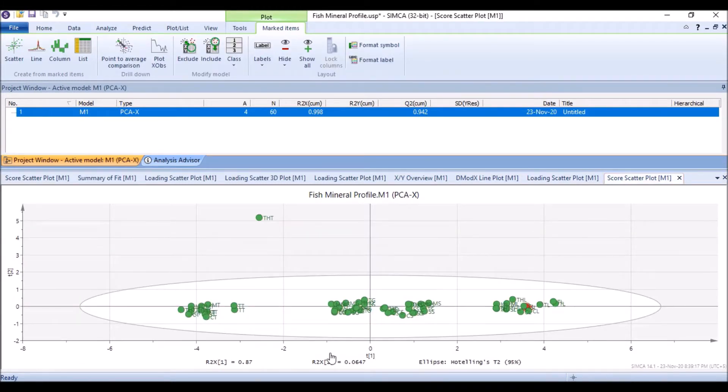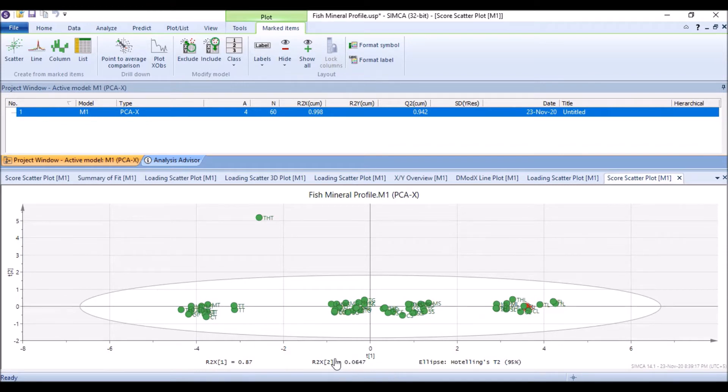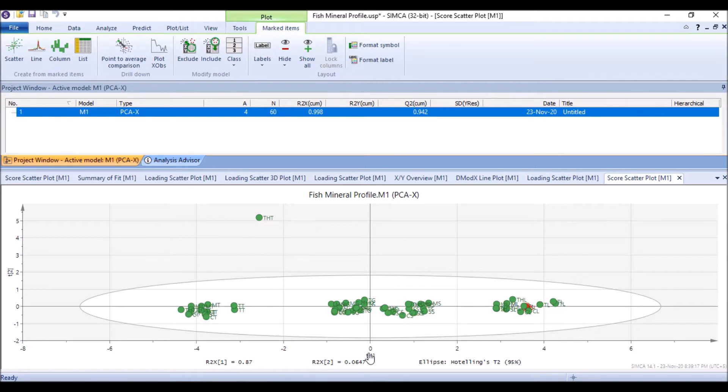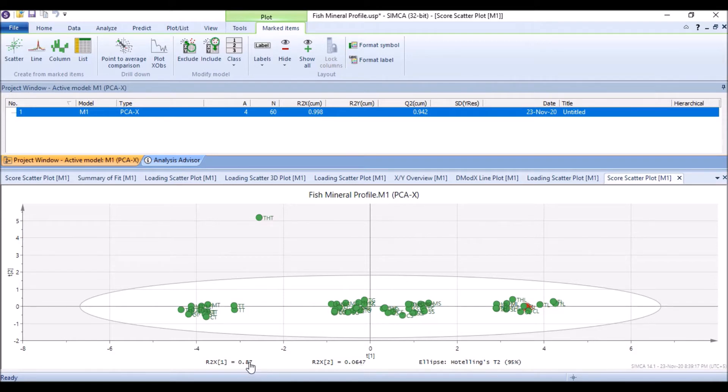For the score scatter plot we have T1 and T2, and this is the weight. This R2X is the weight, and R2X1 is the weight. When we write here in T1, in this location we write PC1, and PC1 in this case is 87 percent. PC2 in this case, this one, it will be 6.4 percent. So this 0.87 will be multiplied by 100 and will be written accordingly. The same 0.0647 will be multiplied by 100 and will be written accordingly.